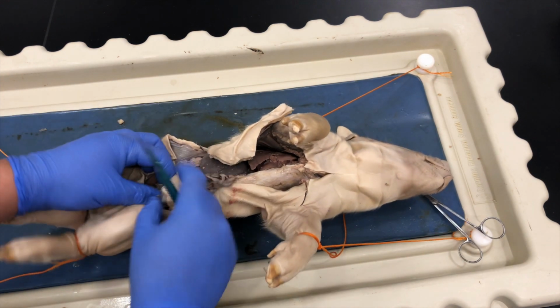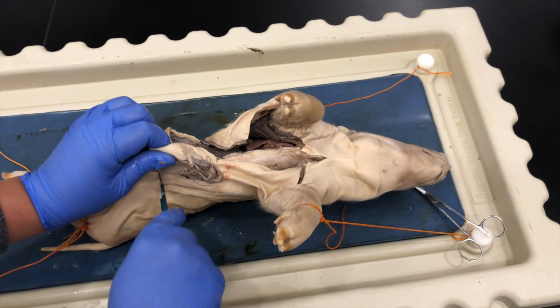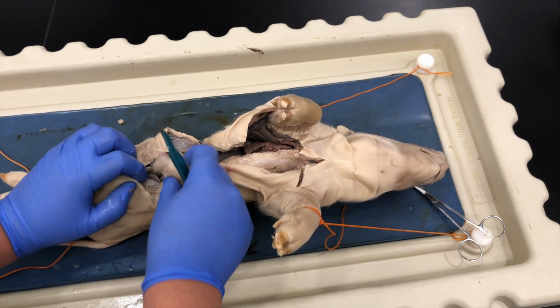Here I am beginning the incision towards the other side of the hind limb as well.